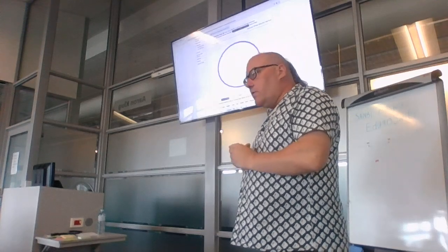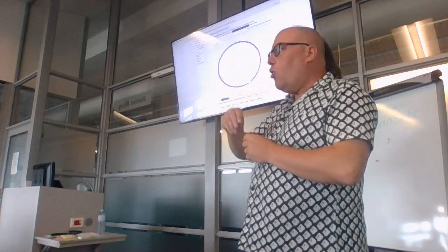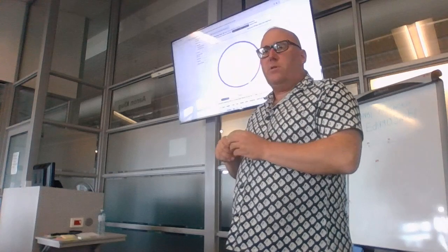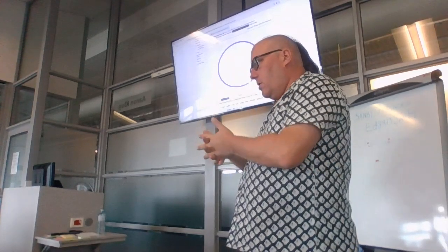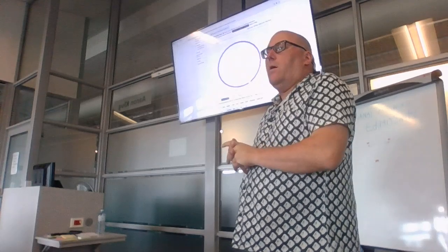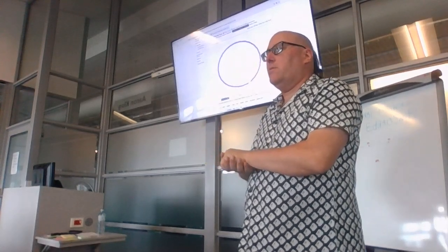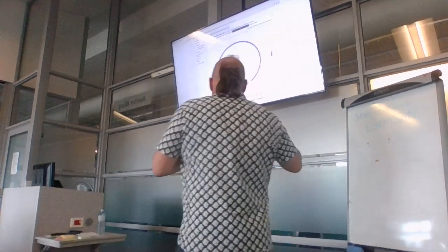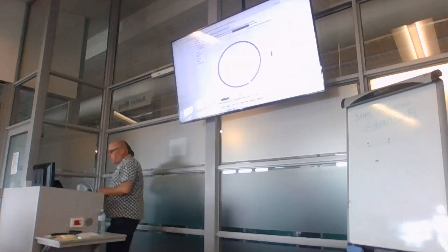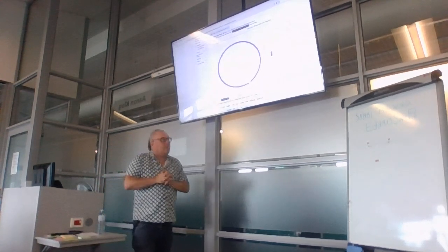Okay, it's very important to have these discussions early on in a sequencing project, so that you don't get people coming with expectations, and then they're like, okay, here's your data. Can you analyze it for me, please? So anyway, that's assembly, but I'm not going to start with assembly. I'm going to start with the easier problem of reference-based methods.